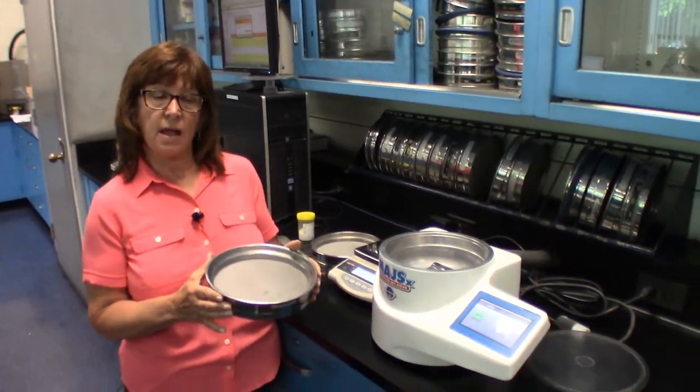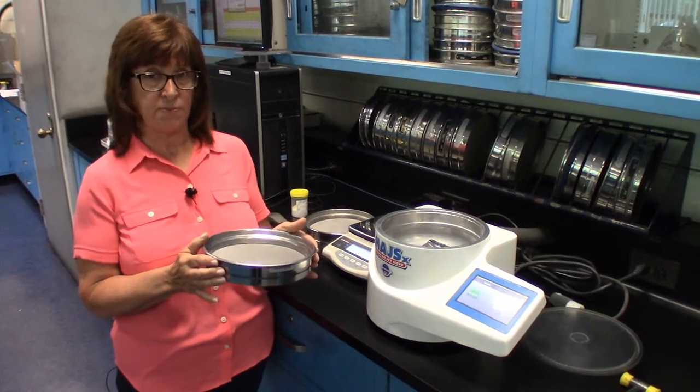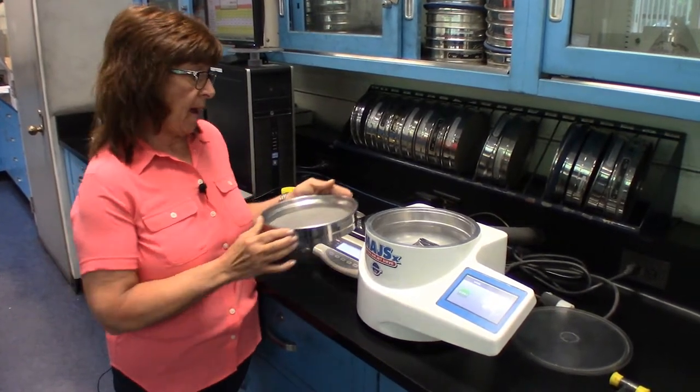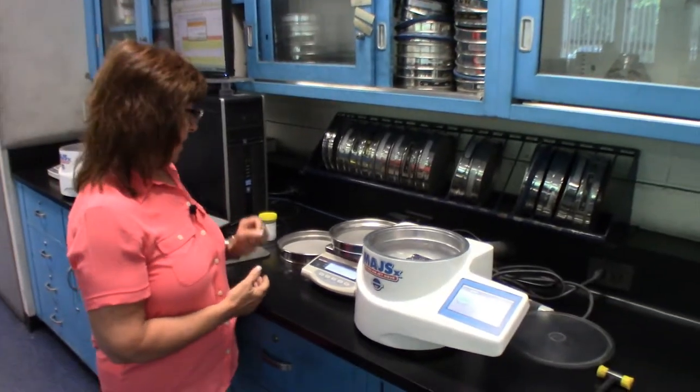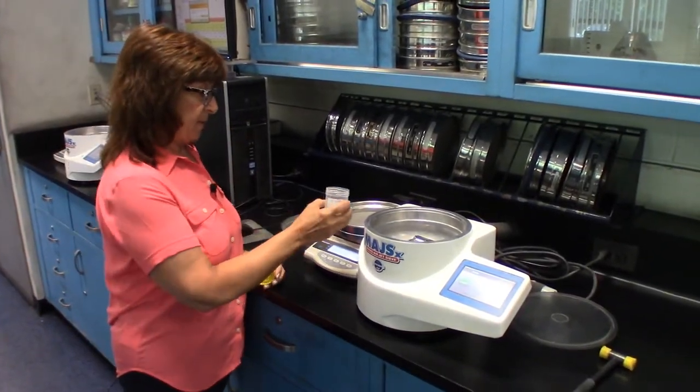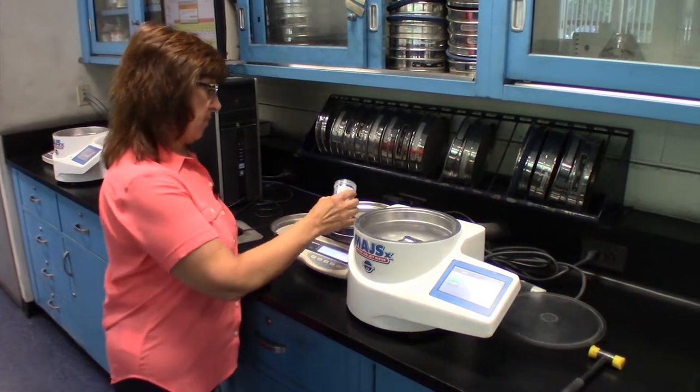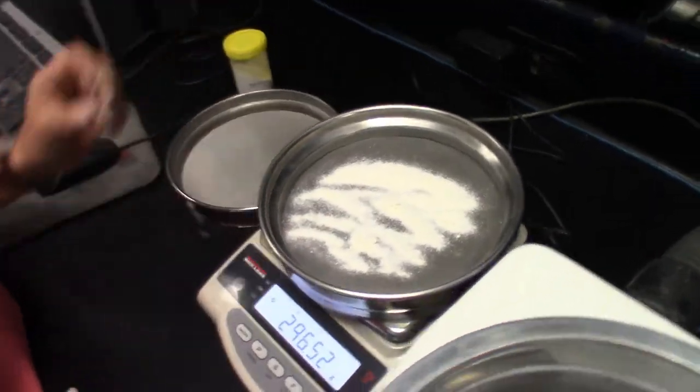To begin the analysis, I will place the 200 mesh screen, which is my finer screen, on the balance. I will record that weight and then I will add my sample. Typically I use a 20 gram sample and then I will record that weight.